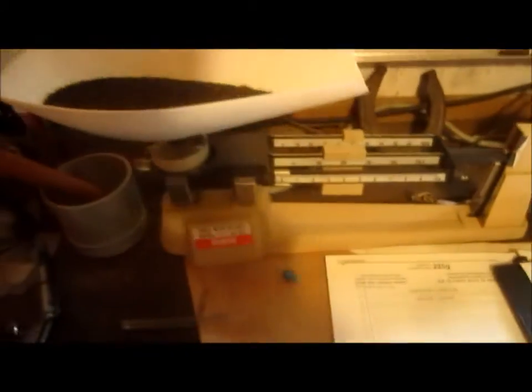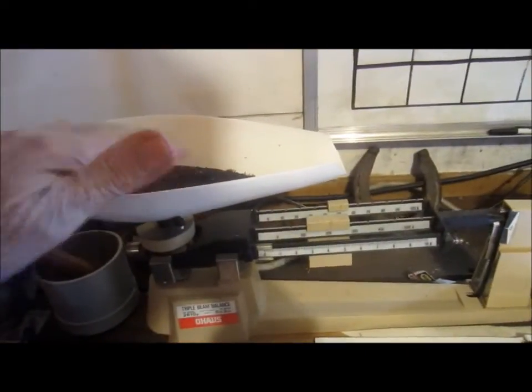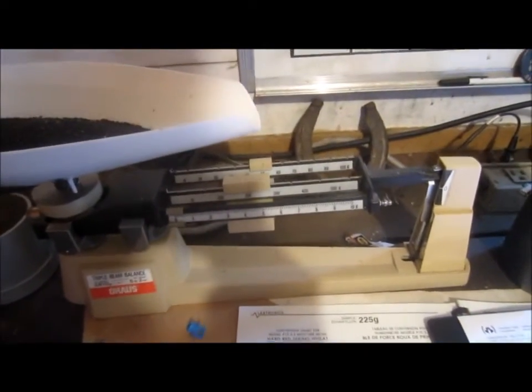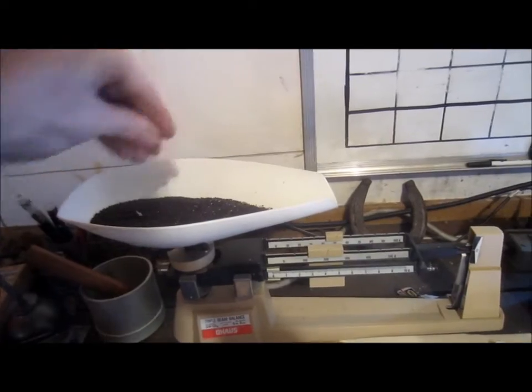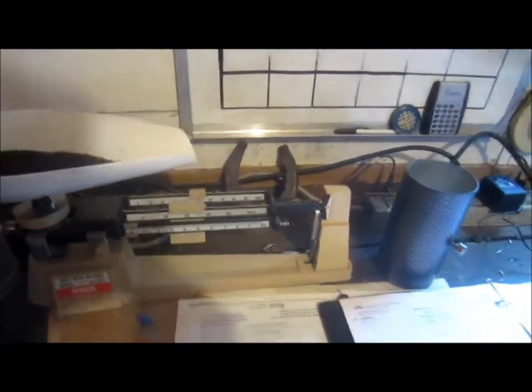I have the old-style beam scale, so you set your scale for 250 grams. We are a little light, so we scoop up a little more canola — a little too much — a little more. Okay, 250 grams more or less.